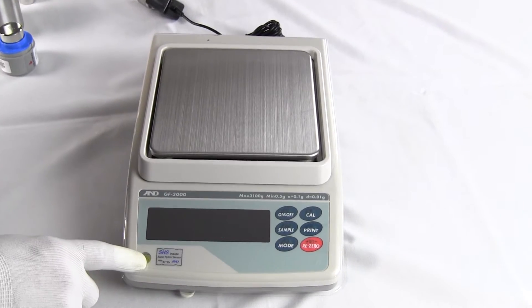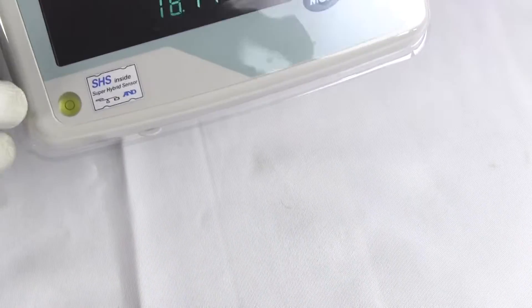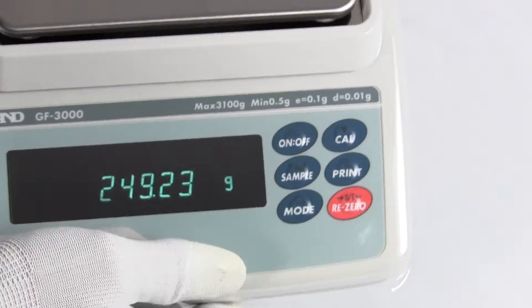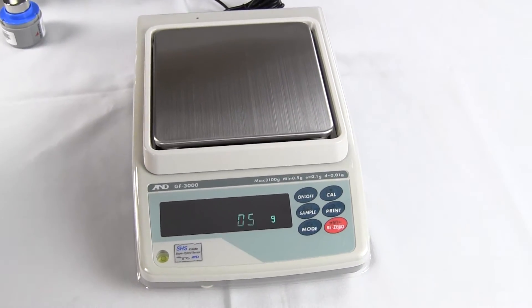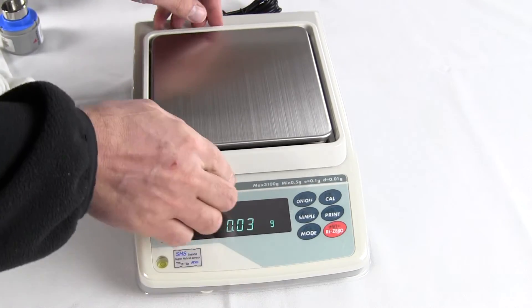The balance has a spirit bubble indicator for easy leveling — that's right in the front of the balance. The balance has a half-dozen keys for easy operation, and we'll go through what each of those keys does.